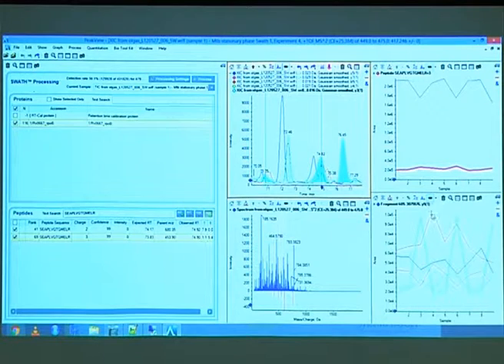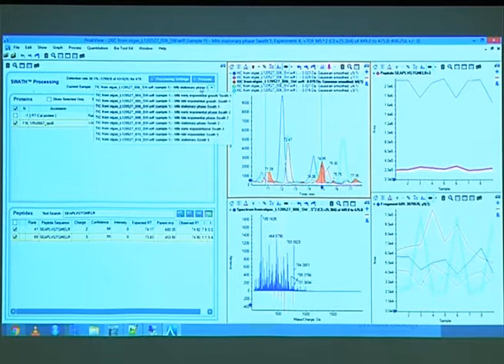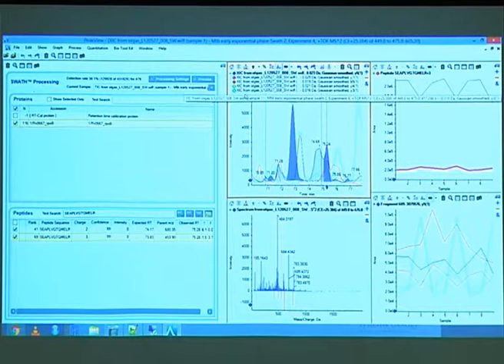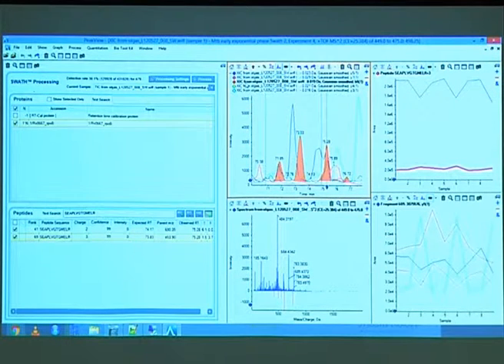I think something similar happened here with the red one. You see here you have 2 peaks, and if you go to number 4, no, it might just, yeah.